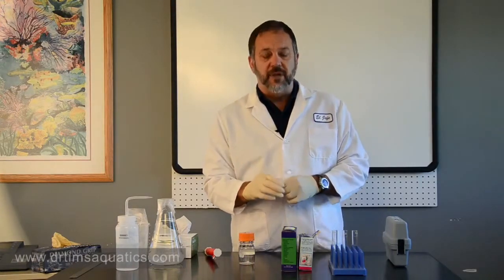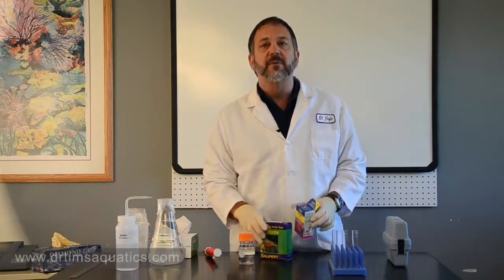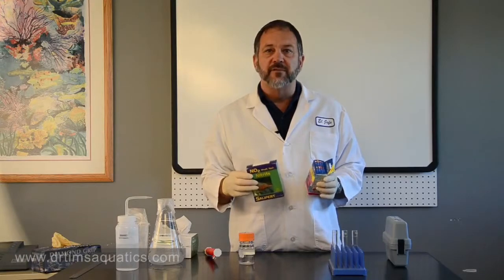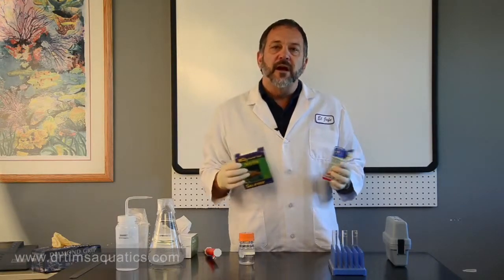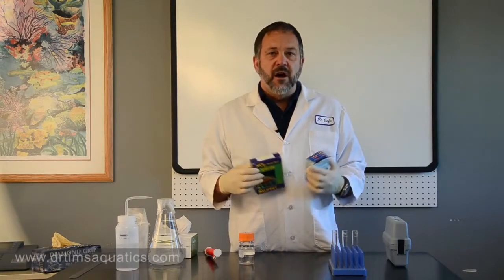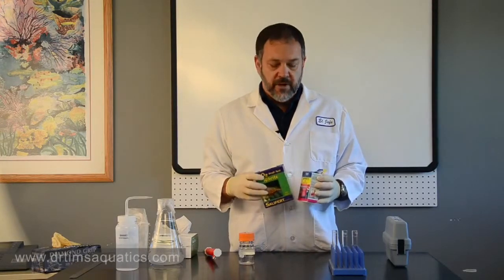For this example, I'm going to use two common test kits: one from Aquarium Farm for nitrite, and also the nitrite test kit from Salifert. But what I'm going to talk about applies to ammonia test kits, nitrate test kits — all the different versions from all the different manufacturers.